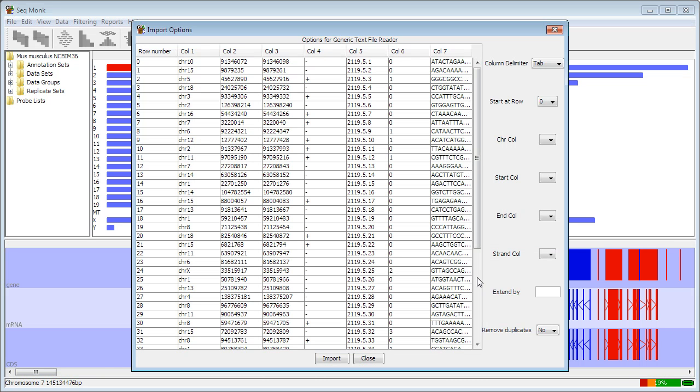Because this is a text import, I now need to tell the program where to find the information it needs within my file. The way to do this is by filling in these boxes on the right-hand side of the import dialog. The first one says what character delimits the different columns in my file. It's guessed at tab and it happens to be right.